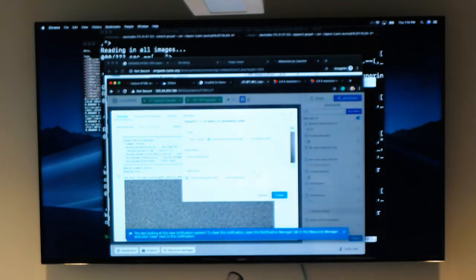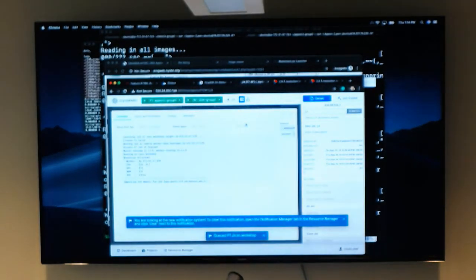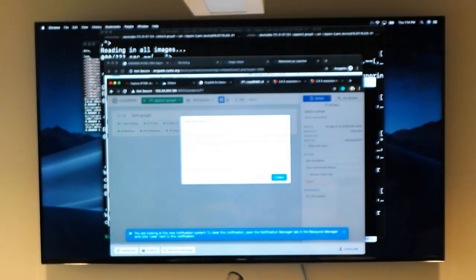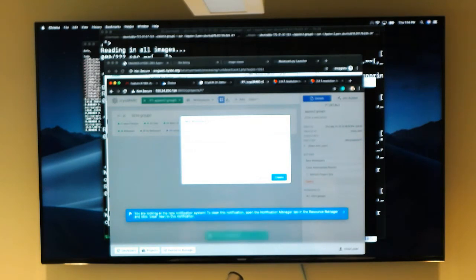What if we just choose the original data set, original protocol? I guess we could do that. Just see what's going on. It definitely works, but I guess it's not the optimal choice. So let me explain it.